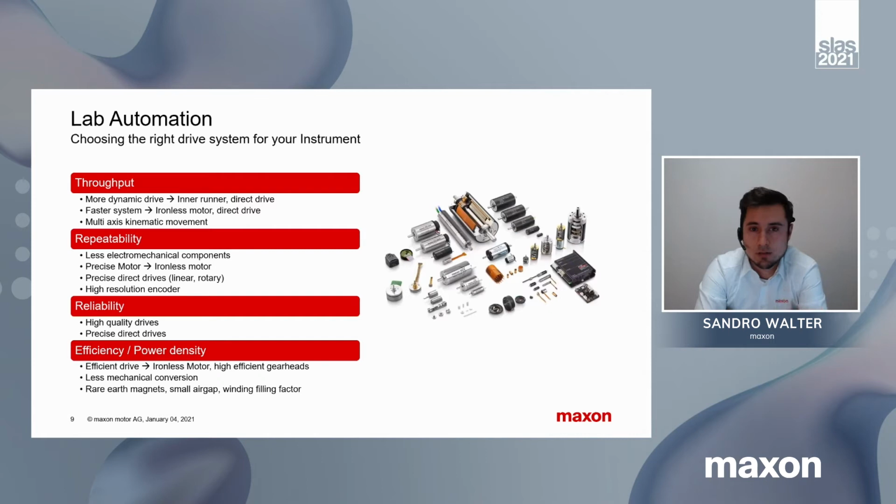So we have talked about what is important in the laboratory just before. When a product or instrument is developed for the laboratory, the question arises which drive technology is best suited for the design. Well, there are many different drive technologies on the market, from brushed to brushless, servo motors with or without iron core, to stepper motors or direct linear or rotary motors. There are many.